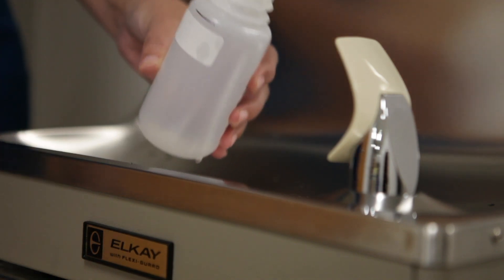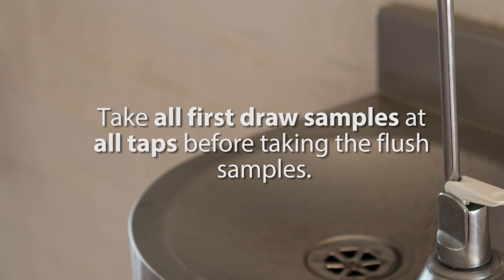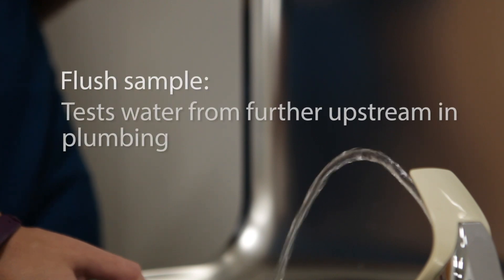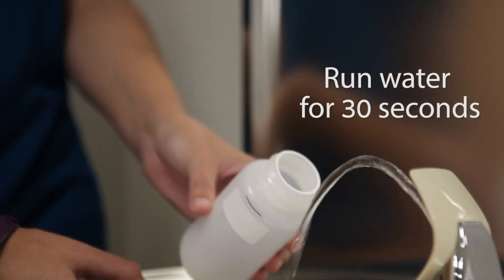Don't let any water go down the drain. Turn off the water and screw on the cap tightly. You'll need to take all first-draw samples at all taps before taking the flush samples. You'll follow the same steps to take flush samples, which tests water that comes from further upstream in your building's plumbing. This time, you'll run the water for 30 seconds before taking the sample.